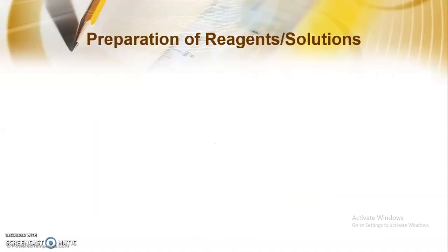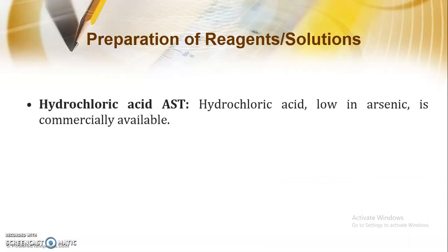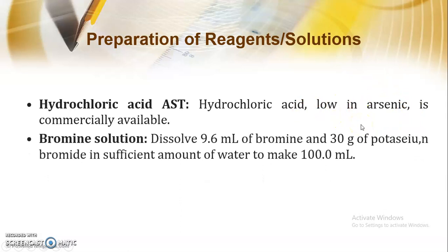Now we will see how to prepare the different reagents and solutions that are required. Now here you can see hydrochloric acid AsT. AsT stands for low in arsenic, which is commercially available. So hydrochloric acid low in arsenic is commercially available, which can be used as it is.